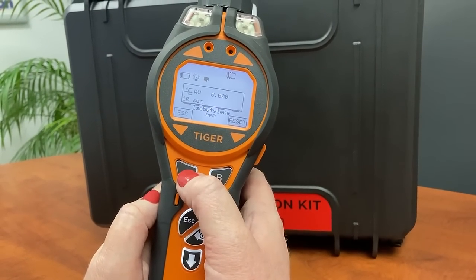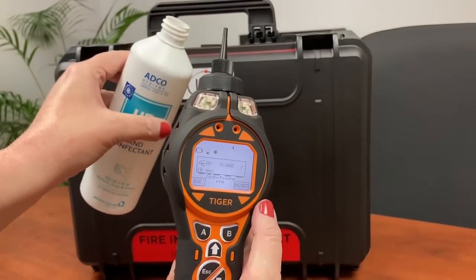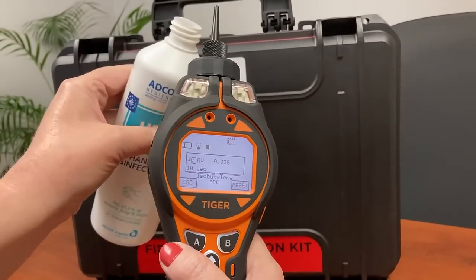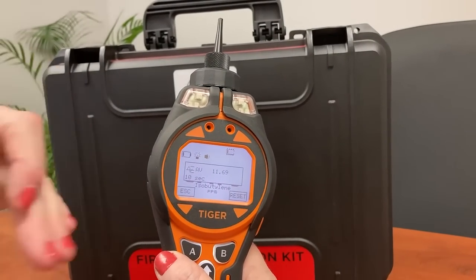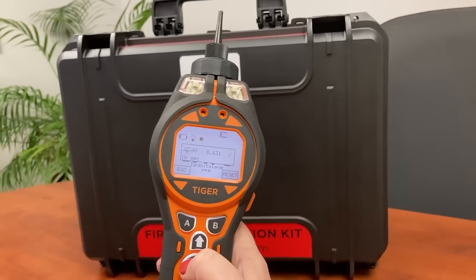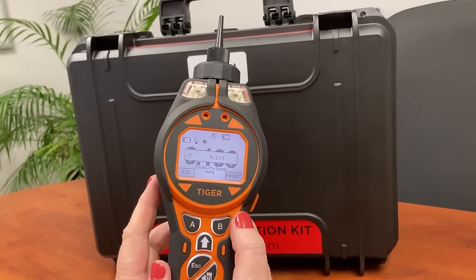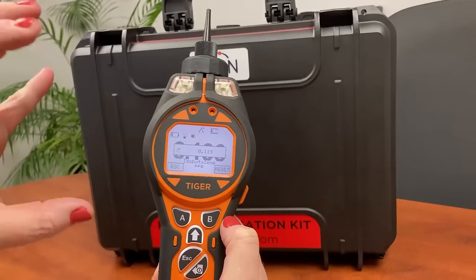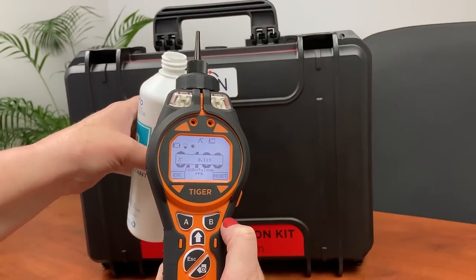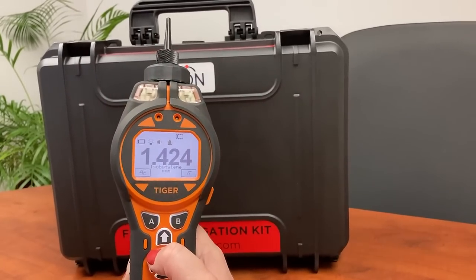The next hotkey is our rolling average, which records over a period of 10 seconds. At the end of the 10 seconds it will give us the average value, tick it, and data log it. On the right hand side we've got peak, which records our highest level detected. Both the average and the peak values are measurable when they are open on the screen — peak gives you the highest value detected at that time and stores it on screen.